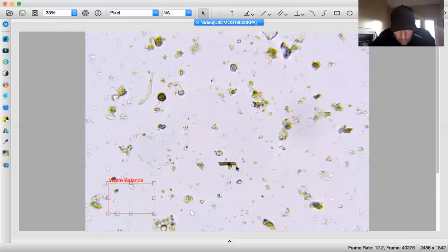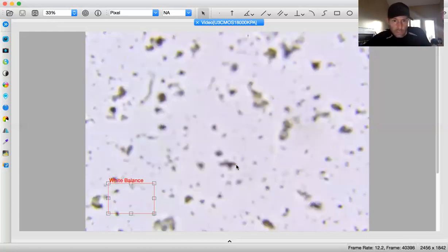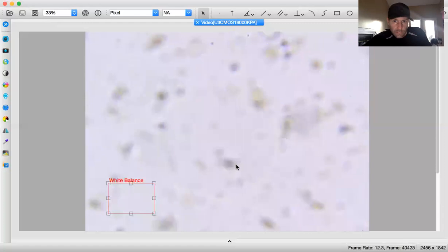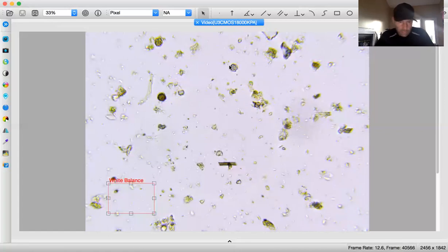That looks like fungi. So, 0.05. Oh, flagellate. See him? Where are they at? Come on. Yep, right there. That's a flagellate right in the top. Finally caught one of them, man. I'm telling you, quick.